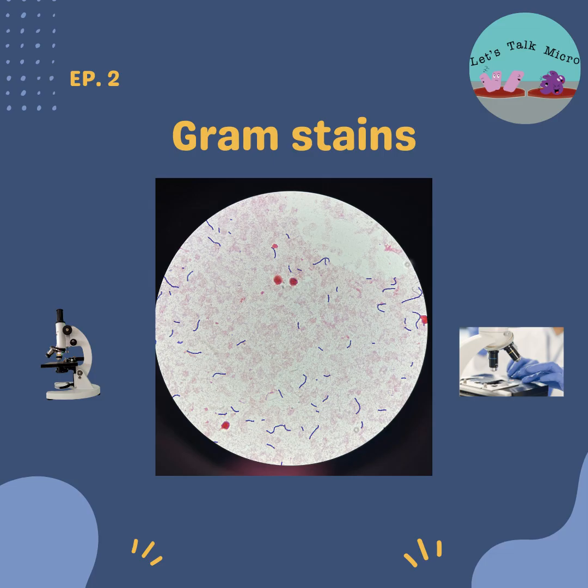But hey, we're all different. We work at different facilities. The important thing is that you make sure that you know what you're looking at. My advice is just to work on your technique first. Make sure that you know the things that can go wrong, so that if something fails along the way, you know that something is off. So if you end up with purple bacteria, but you know that it's pink, you are able to recognize this. But this just comes with experience, repetition. And I'll keep saying this along the way. It's all about repetition.